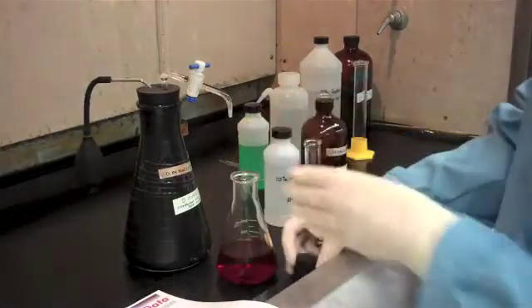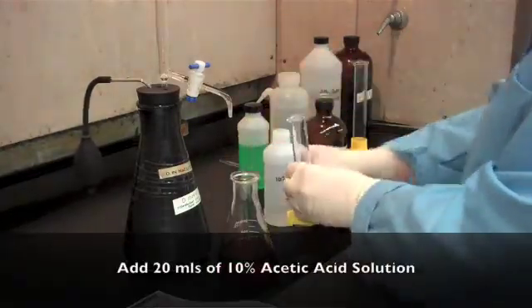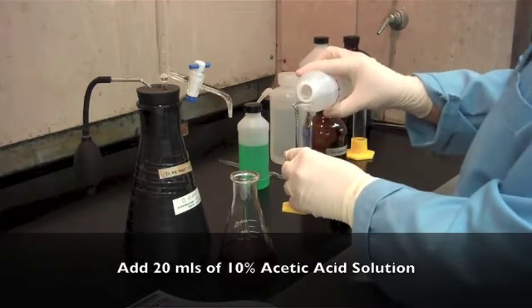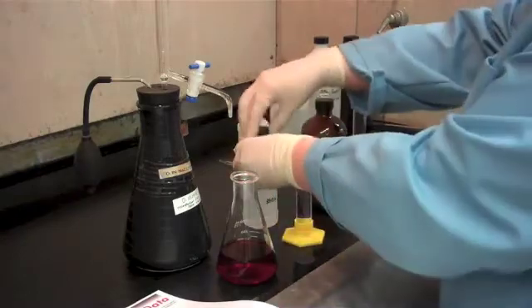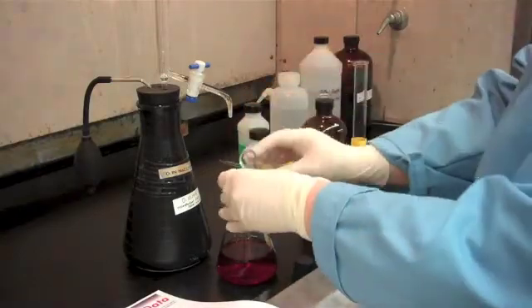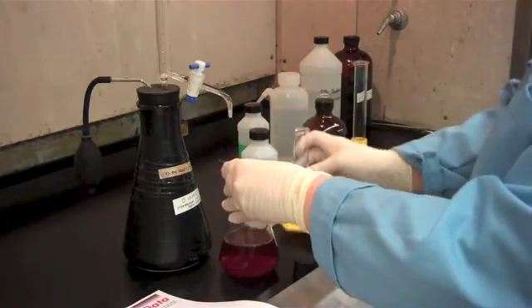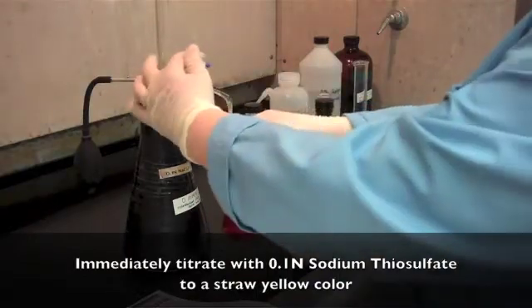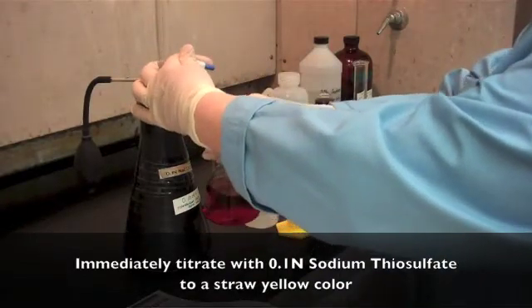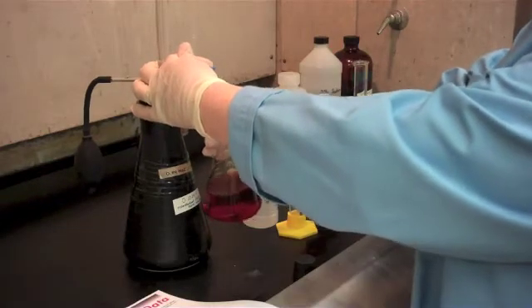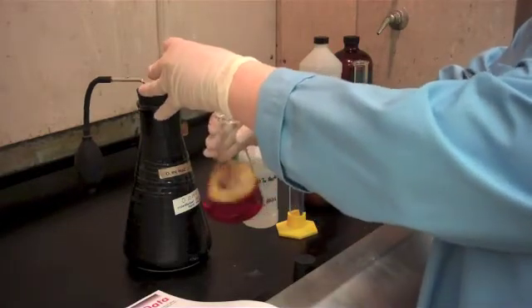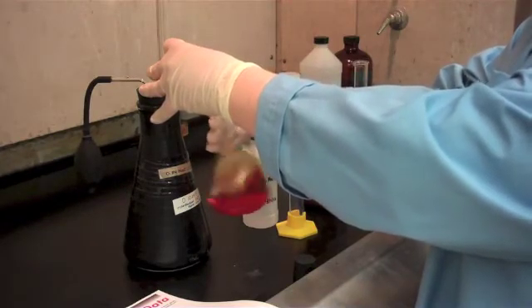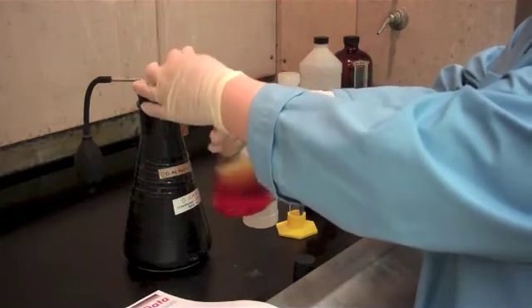So now you unstopper the flask, and we're going to add 20 milliliters of 10% acetic acid. And we are going to titrate to a straw yellow color with 0.1 normal sodium thiosulfate. And you'll see as the reaction progresses, it goes from dark to light yellow.